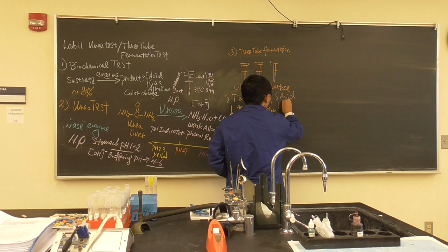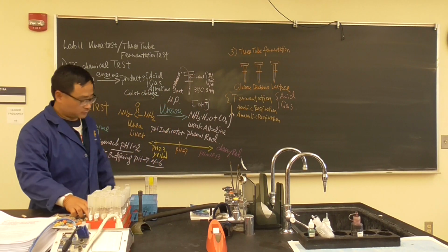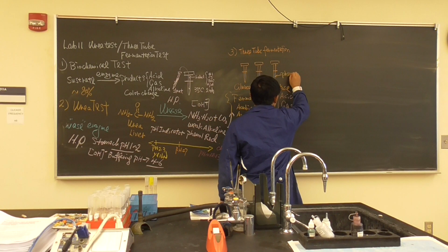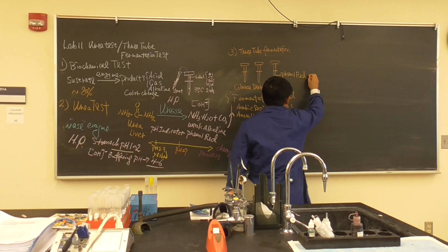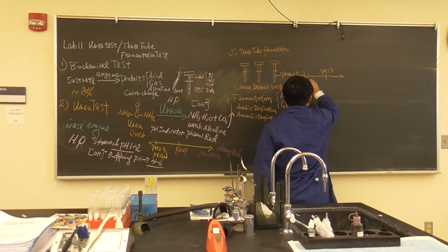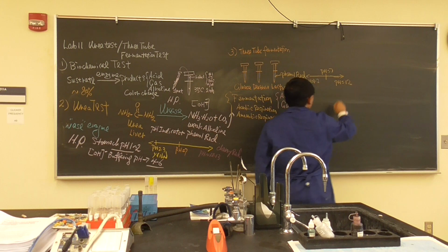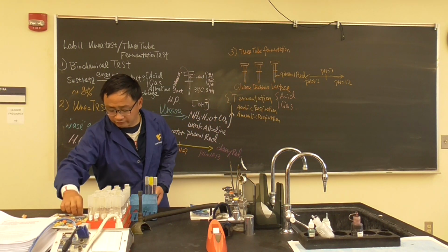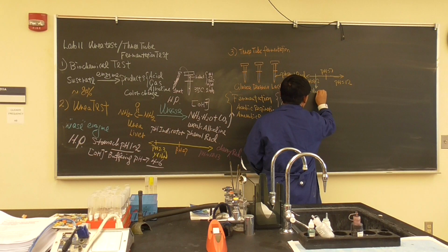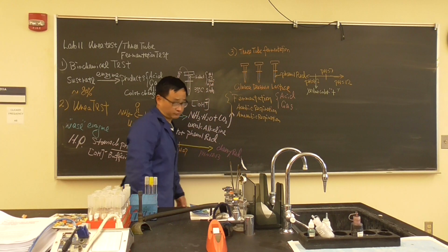Acid and gas. Okay, how do we know the acid is generated? Same thing here. Inside, we add phenol red. This time around, the only difference is we don't care about alkaline, because acid generates. So what are we looking for? We are looking for a yellow color. If it's yellow, acid fermentation is positive.